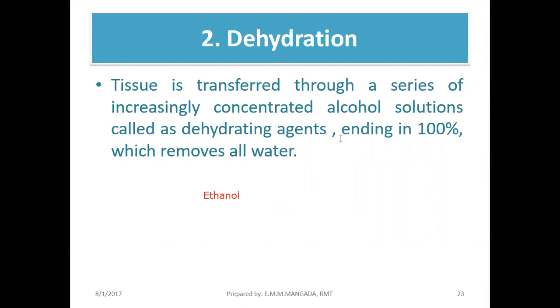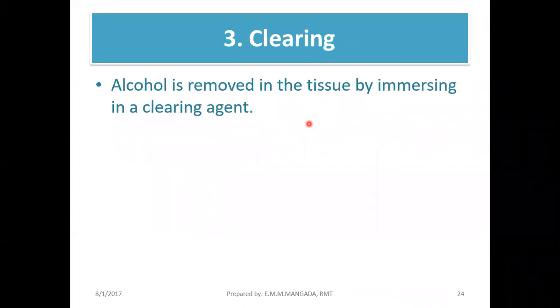Again, what's the purpose of dehydration? To remove the intracellular and the intercellular water from the tissue to prepare it in absorbing the different solutions we will be using dun sa next processes natin. Okay? So guys, so next procedure is your clearing. Okay? Guys, yung clearing natin, this is also known as your dealcoholization.